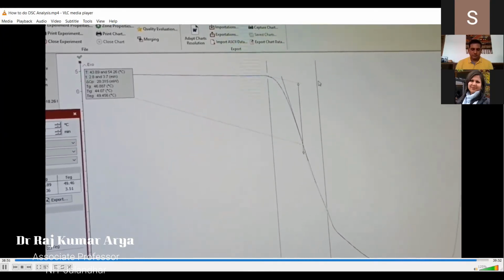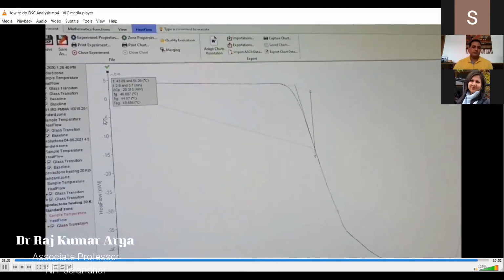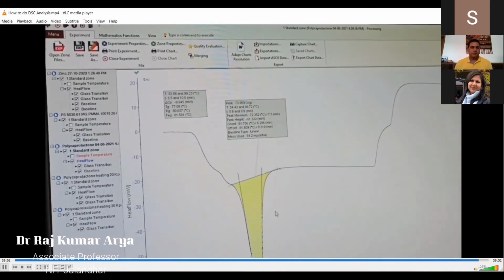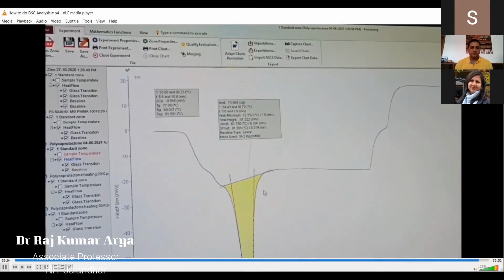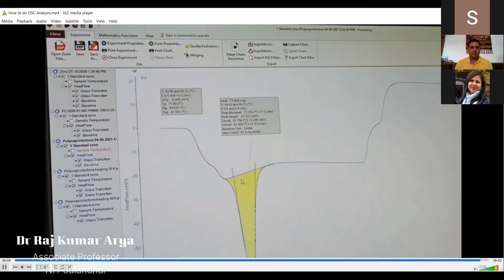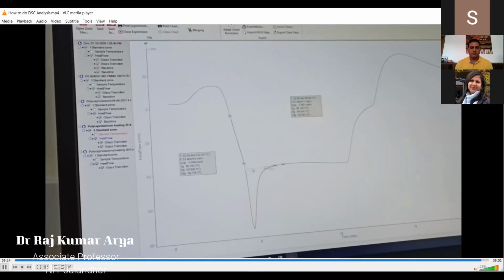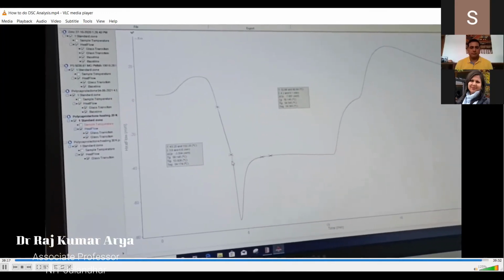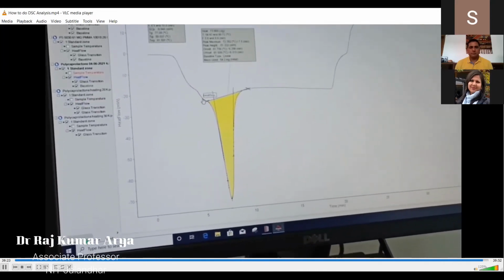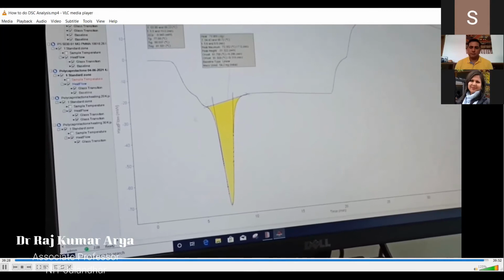So you are not advised to use an excessively high heating rate, and therefore a heating rate of 10 is always advisable, or a moderate heating rate. It will give everything fine and no sample relaxation issue. As a general rule, 10 is a good one. Otherwise, you can go for 20 if you want a faster change, but still you see the nature of the curve here is distorted a lot compared to here. Here you find a change, then a decrease, the transition occurs and ends. So this is a good thing.